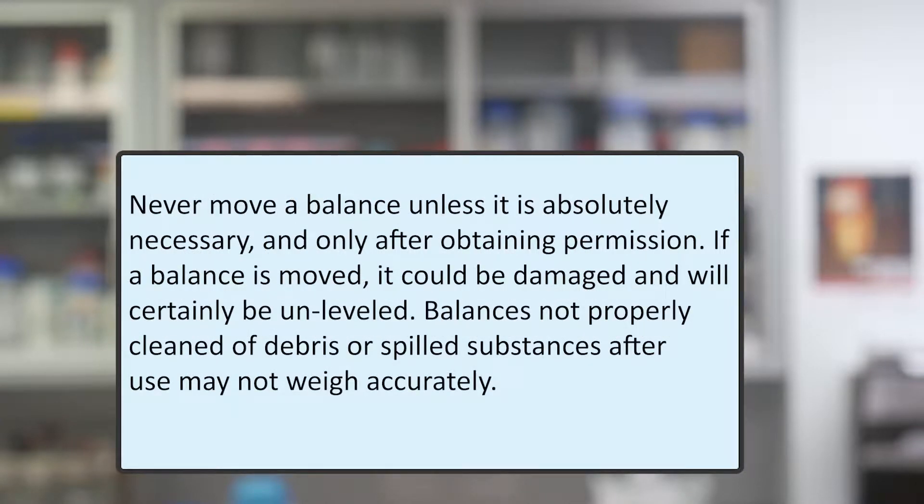Never move a balance unless it is absolutely necessary and only after obtaining permission. If a balance is moved, it could be damaged and will certainly be unleveled. Balances not properly cleaned of debris or spilled substances after use may not weigh accurately.